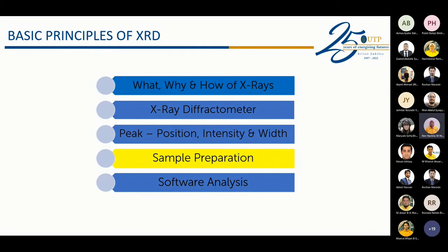Okay. So for sample preparation, I will invite Mr. Irwan, who is the PIC of XRD in CAL, to brief you on the sample preparation and the suitable samples for XRD.